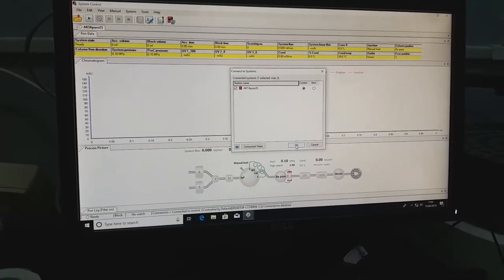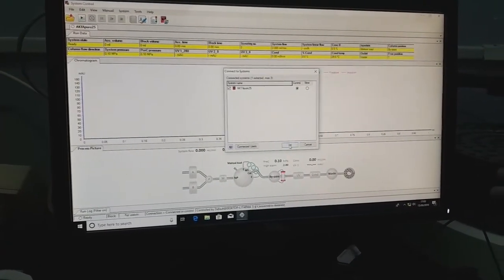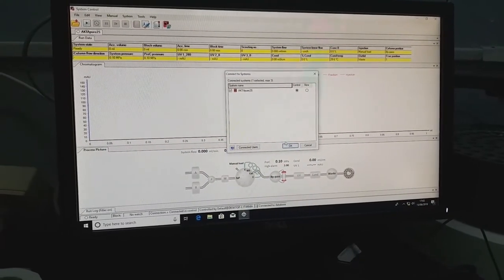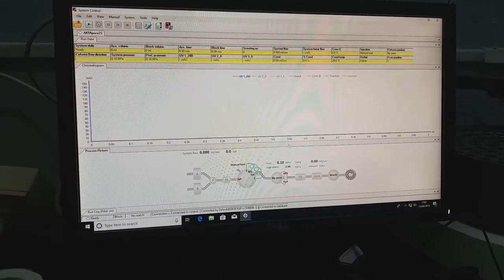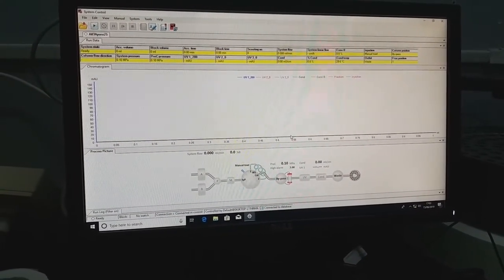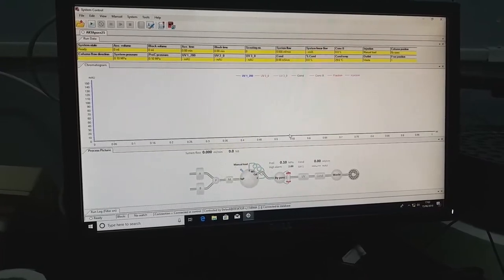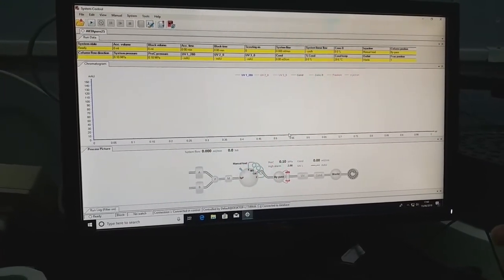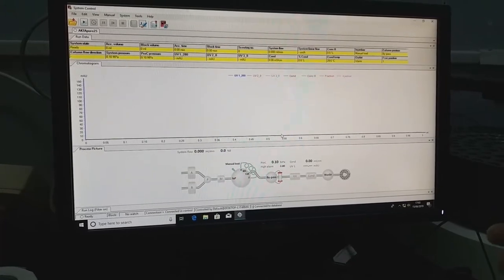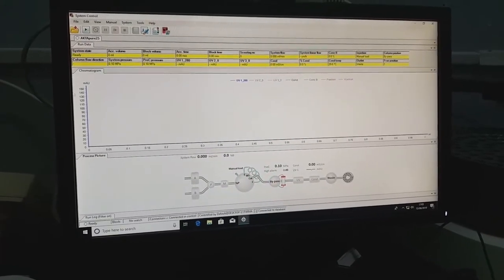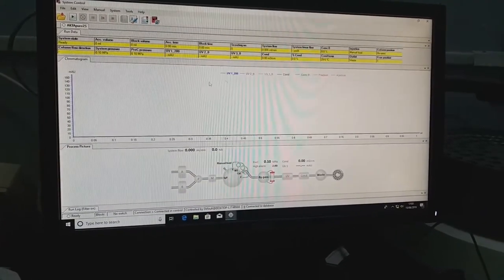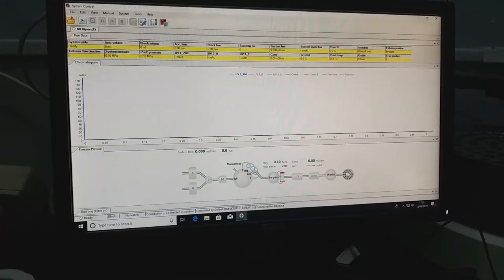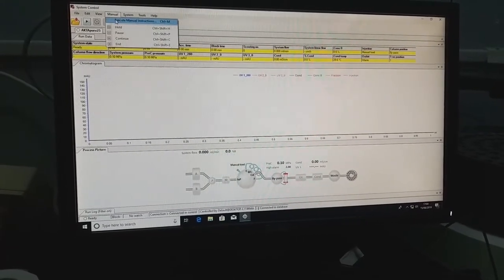Here you can see the connected instrument — ÄKTA pure 25. Just click OK and it will connect the system. Once connected, we can change different commands and parameters using this software.